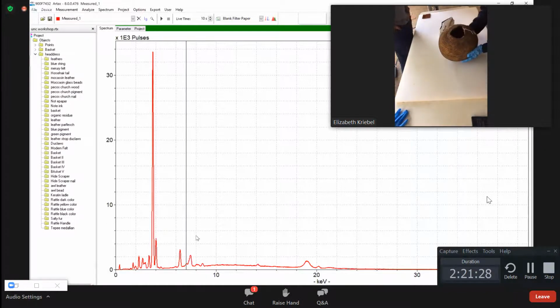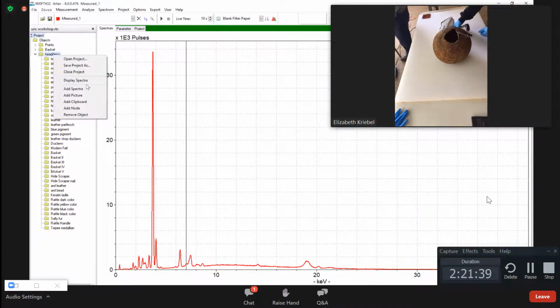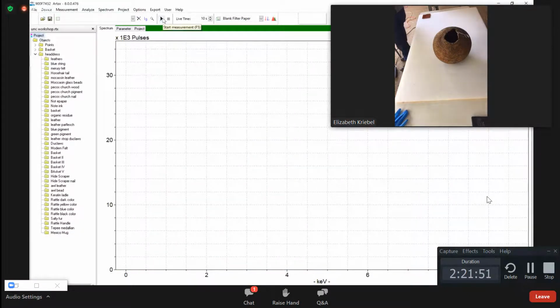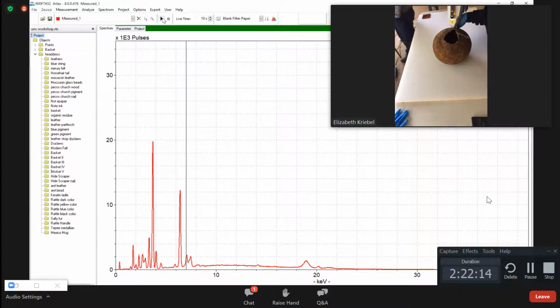Yes. This one's got a logo on the bottom with a tag. We've got 67.9.1. All right. So closing this. And this looks pretty universal to me as far as where we should test. I think most of these baskets, we just do a point on them and then we call it good. So wherever you feel comfortable. Great, and I'm ready. All right, starting. All right, got it. Definitely nothing toxic. Standard wood calcium material, a little more silicon than I would have guessed.